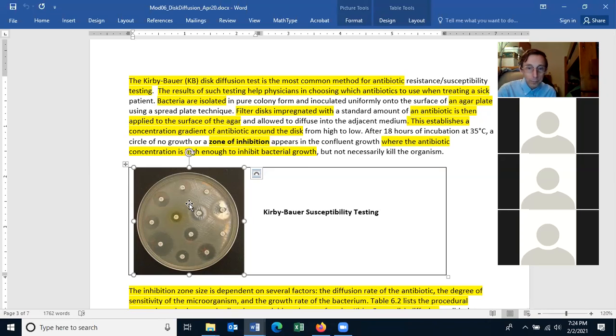Probably because you can have multiple different antibiotics against one bacteria. Okay, we're talking about disinfectants in this case being in the disc, not antibiotics. And then the disinfectant diffuses out of the disc and creates a zone of inhibition. Okay? And so why is this test not such a good test for testing different disinfectants?